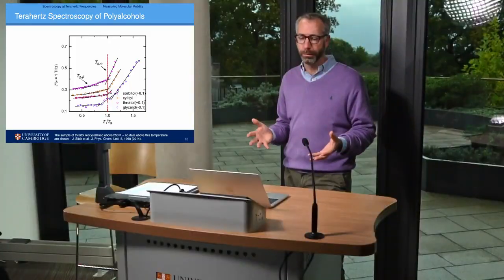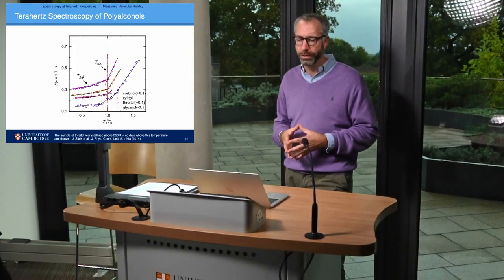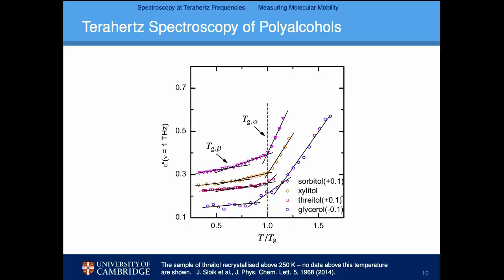That is not too surprising, as the intensity of the dipole moments in the sample is expected to increase as increasing amounts of thermal energy are supplied and the molecular mobility in the system increases. Furthermore, we can observe a strong change in absorption at the glass transition temperature. At temperatures above Tg and below the Tg, the change in absorption with temperature appears linear in both cases, and there is a clear difference in the gradient at Tg.